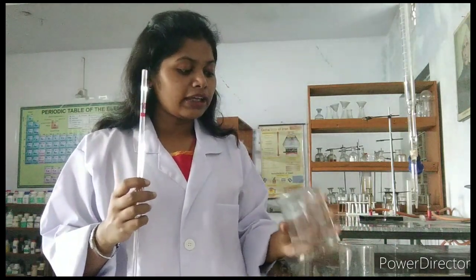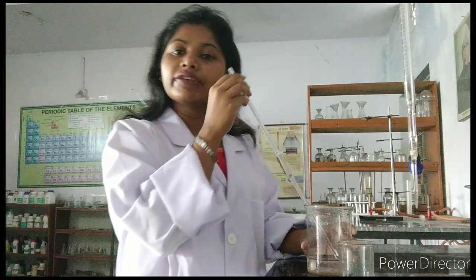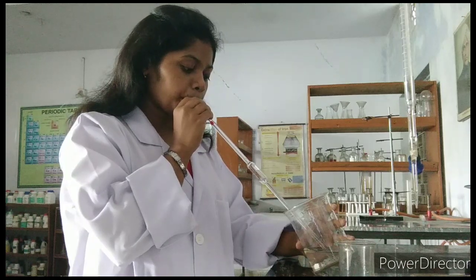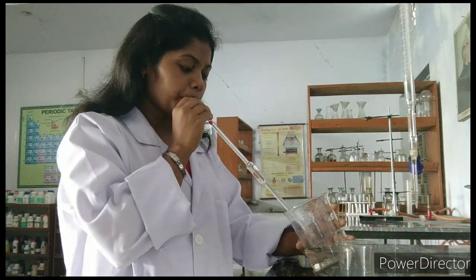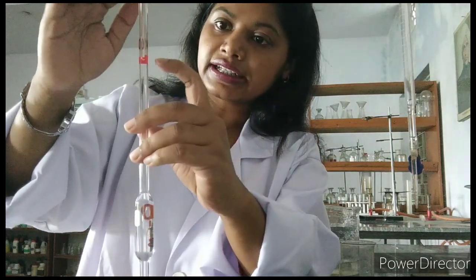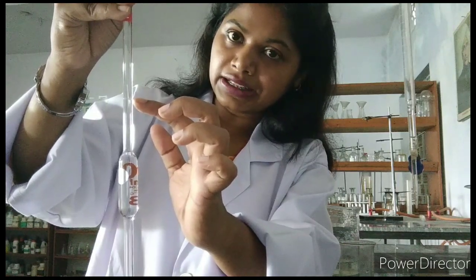To show you, I have kept tap water here in this beaker. Now what we will do — we will suck water with the pipette. So I am sucking. Done. As you can see here, I have sucked water till here but the edge mark is here. We need water till the edge mark only — this is till 10 milliliter.